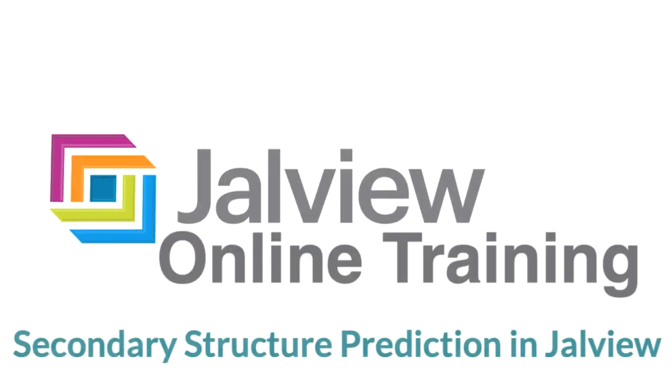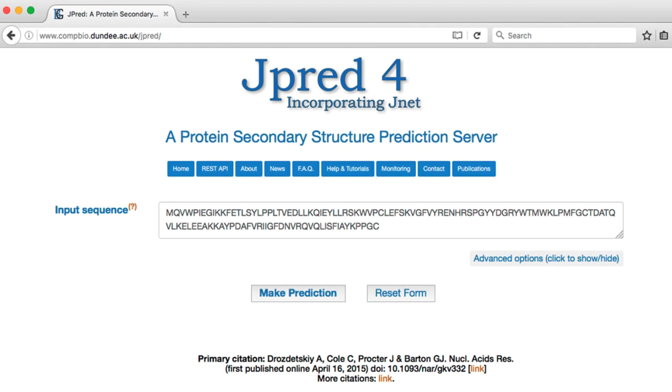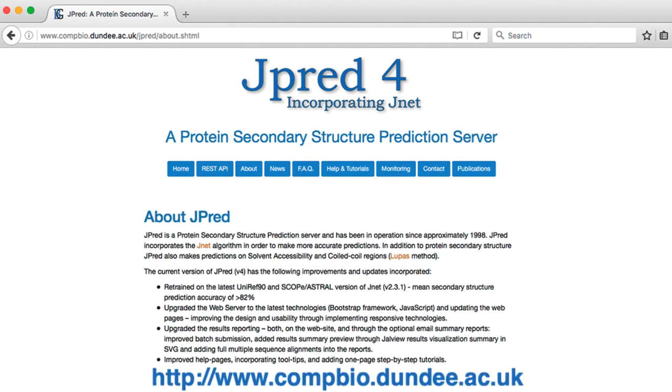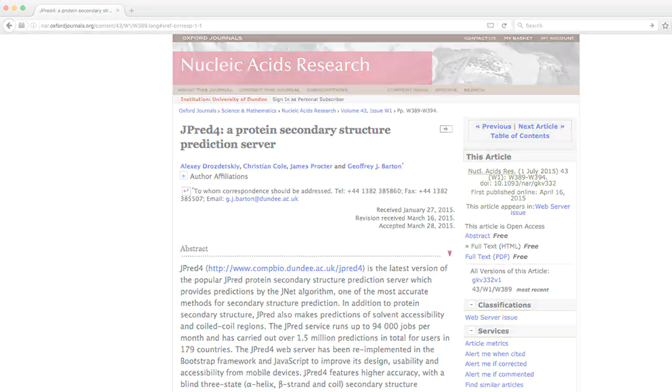In this Jalview online training video, I will consider how to do secondary structure predictions of proteins in Jalview. The prediction is performed using the JPRED server at the University of Dundee. For more information, I recommend visiting the JPRED website and reading their research papers.